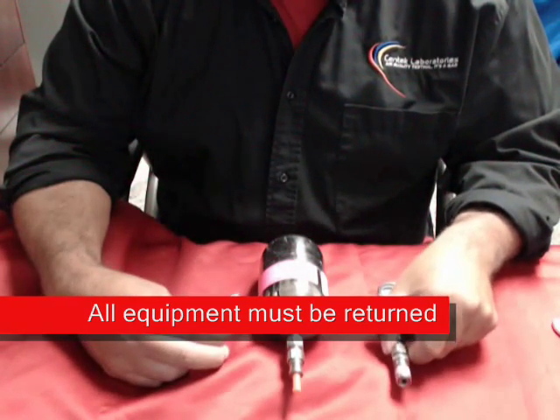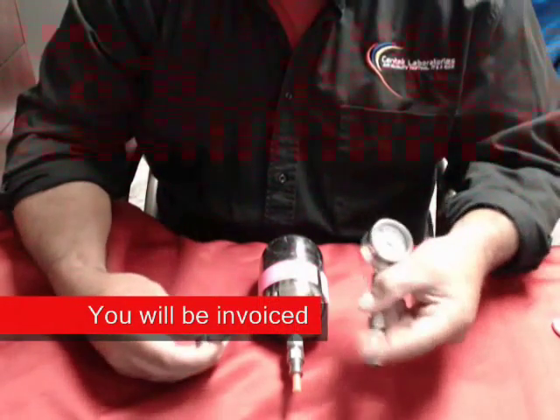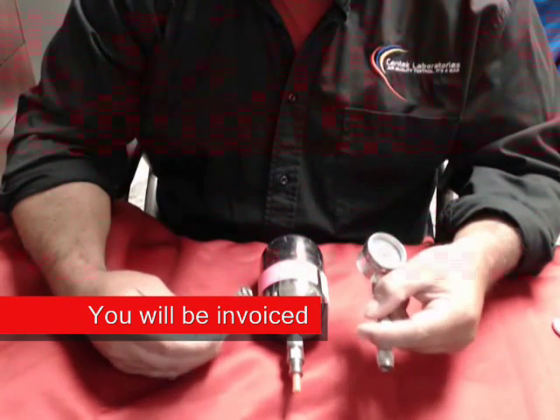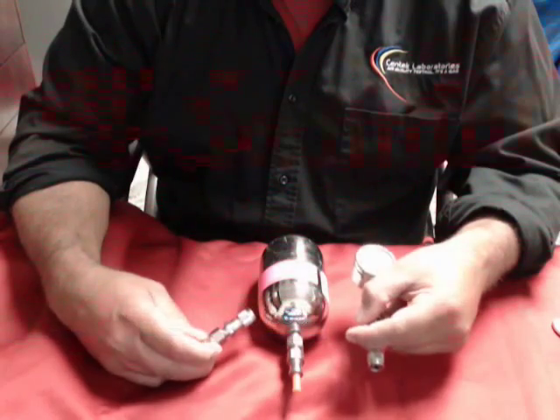Please do not hold onto this equipment, especially the quick grabs and the gauges. They're several hundred dollars, and if they are not returned to us, you are subject to be invoiced for them.